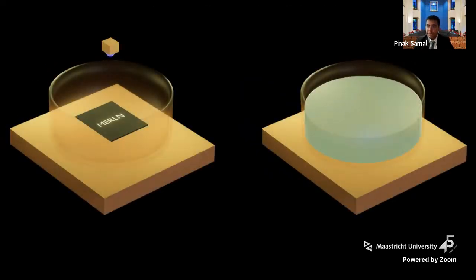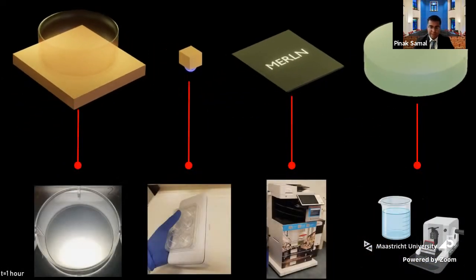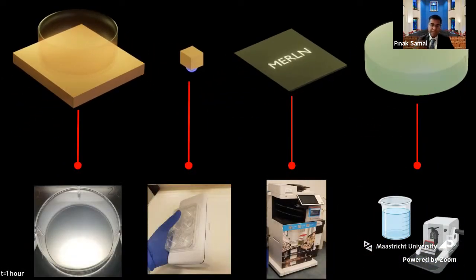Now you could ask, okay, well, you use a polystyrene substrate, but let's say a chromium quartz mask is maybe not accessible. Let's say a specialized UV source is not accessible. So how is this adaptable to a biomedical laboratory? So to further simplify this process and to make a process such that you could get into the lab within an hour, select your pattern, print it, and then do the whole process in the lab itself, we optimized and simplified the process.